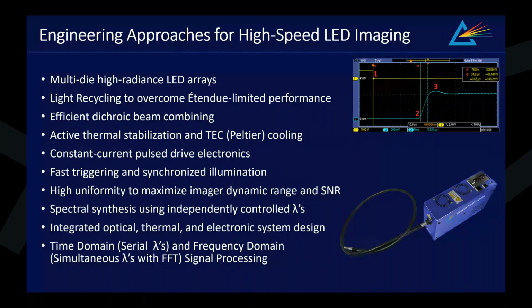Although xenon flash has very high pulsed energy delivered on the microsecond timescale, LEDs can compensate at the system level with higher repetition rate, synchronization, wavelength optimization, and minimal jitter.